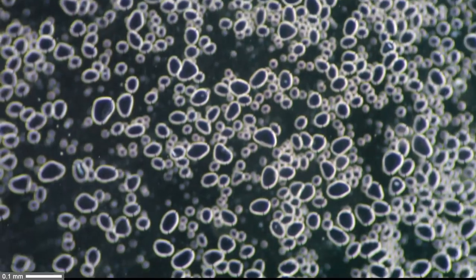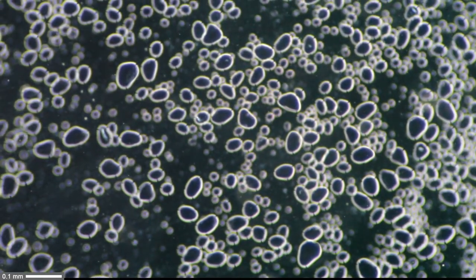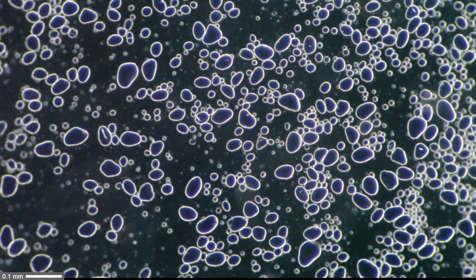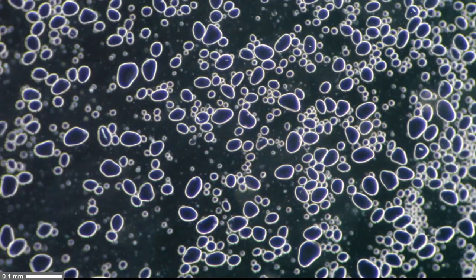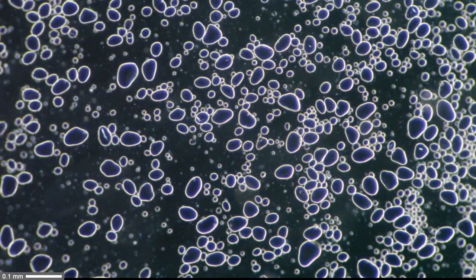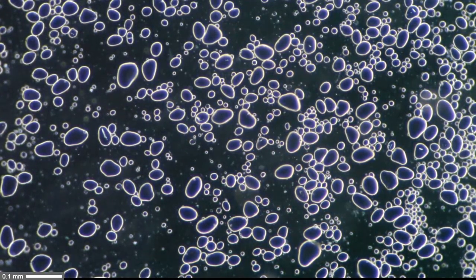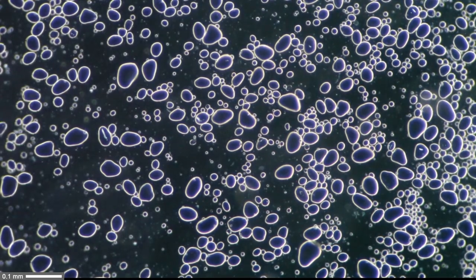Not every specimen is very suitable for dark field microscopy. You have to have a difference in refractive index and this is the case here. You can see that the starch grains do look a little bit purple.